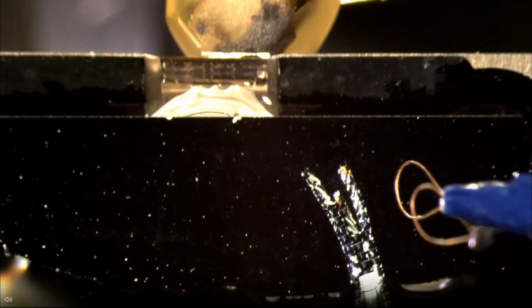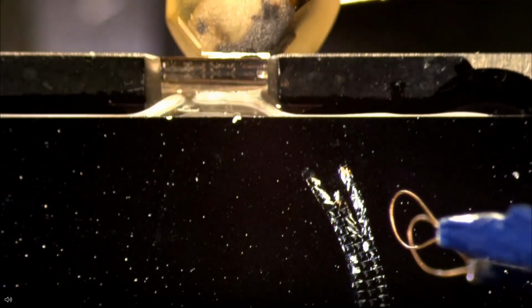Now we lower the water level. You can see they are nicely attaching side by side. And after it has dried a little bit and we changed the angle of illumination, you can see nicely how they sit beside each other here on the wafer.